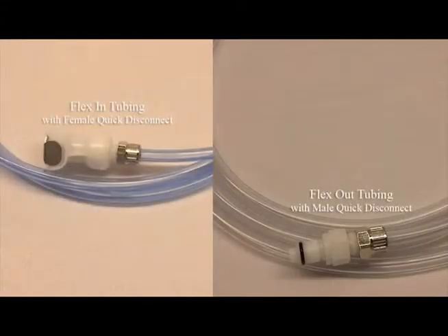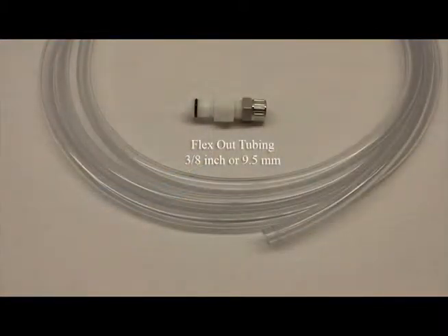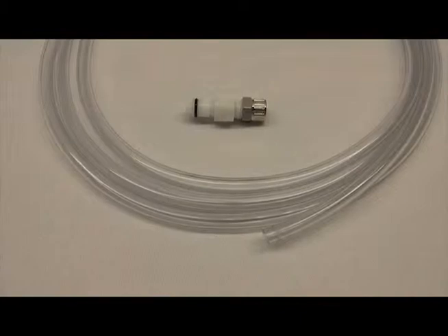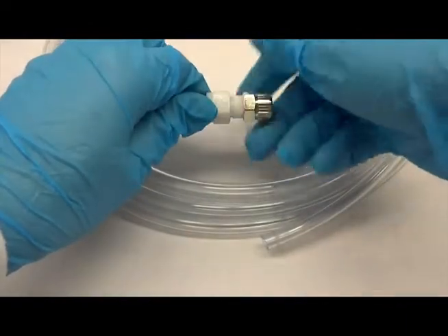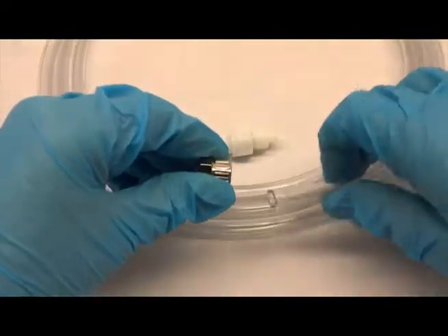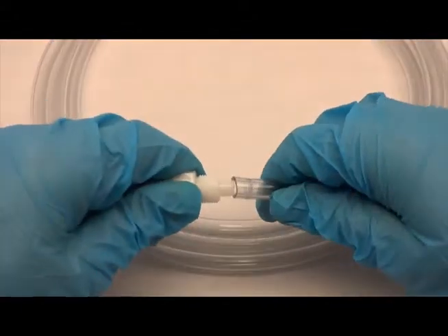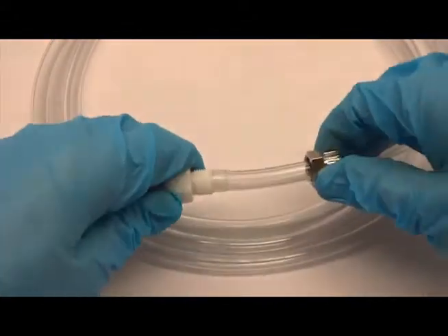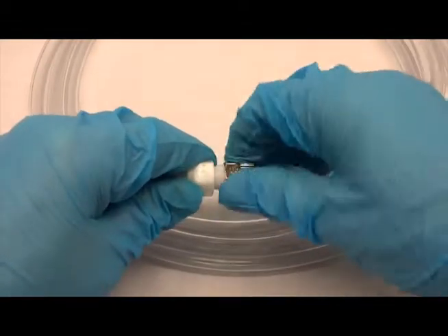Connect quick disconnects to the other ends of both the flex out and flex in tubing. For the flex out tubing, use the clear 3/8 inch or 9.5 millimeter tubing and attach the supplied male quick disconnect. To do so, remove the silver nut and slide it onto the tubing. Insert the tubing onto the barb of the quick disconnect until it is completely inside the tubing. Reconnect the silver nut by hand.